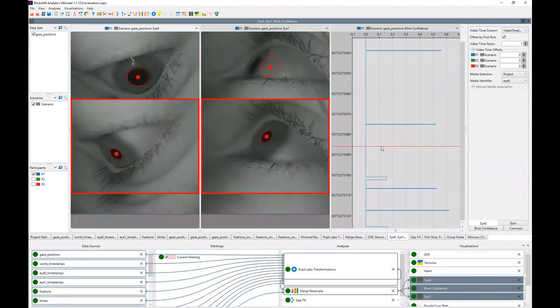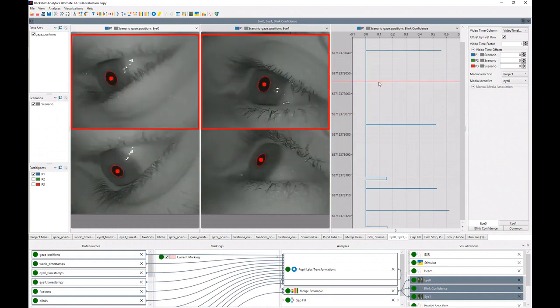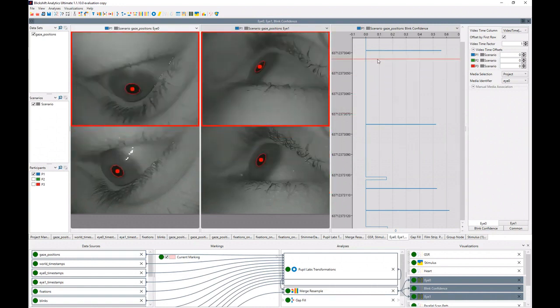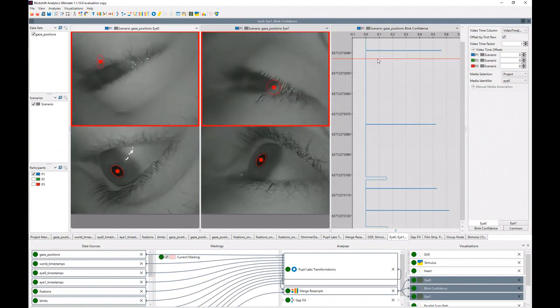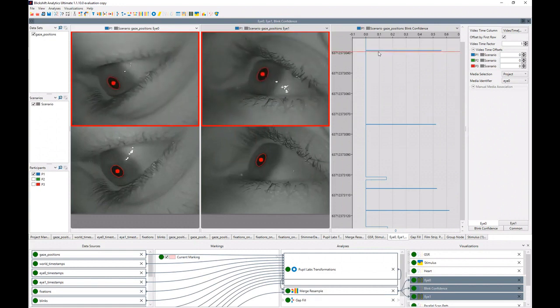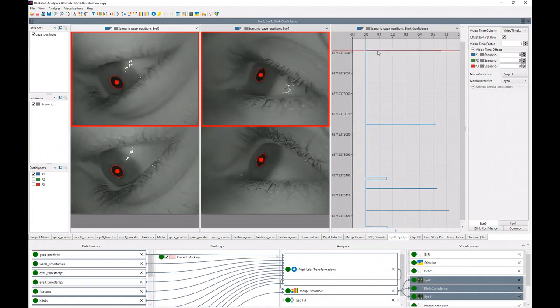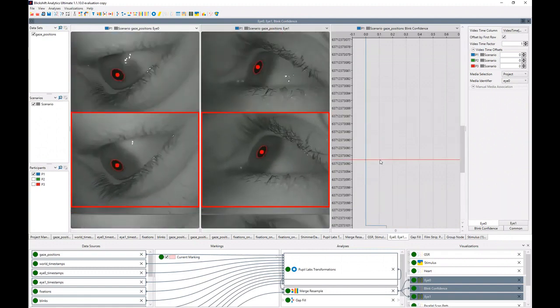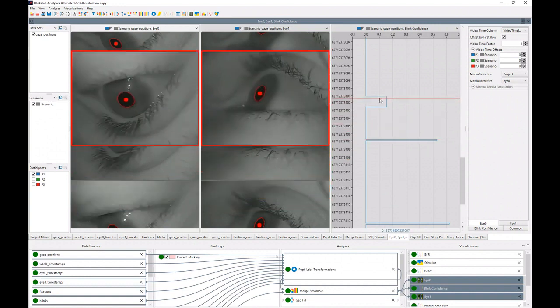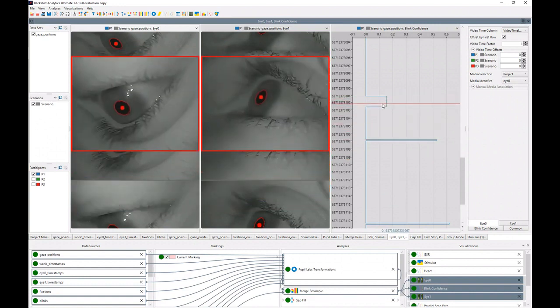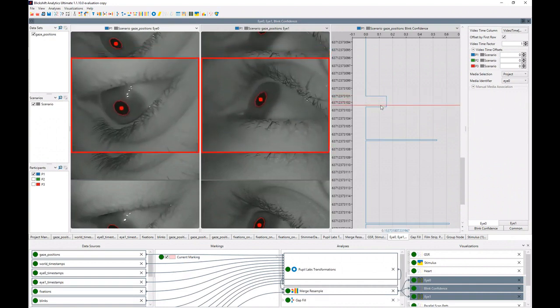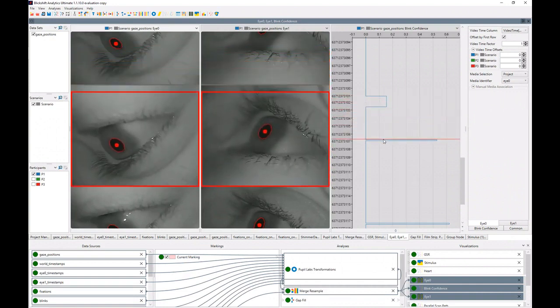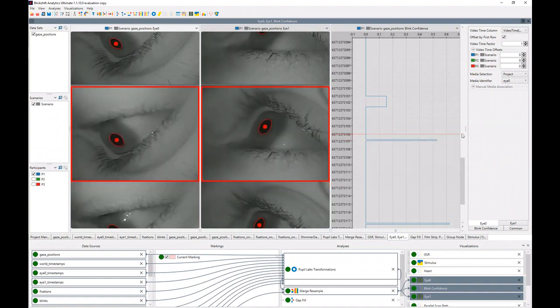Here the eye videos are already being visualized and in addition to that we are displaying the blink confidence reported by the blink detector of Pupillabs. We can see that when the blink confidence is higher than 0.5, there is a blink in the video. Here the blink confidence is quite low, and we can see why — there is a blink and then another blink in short consecutive order, and for some reason the blink detection puts them together but with a lower confidence.